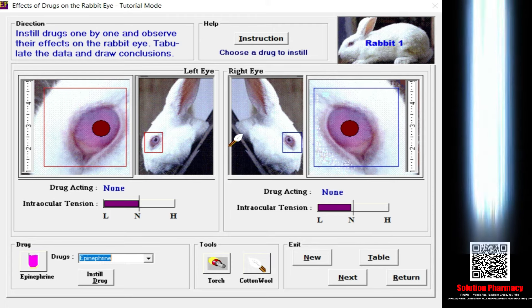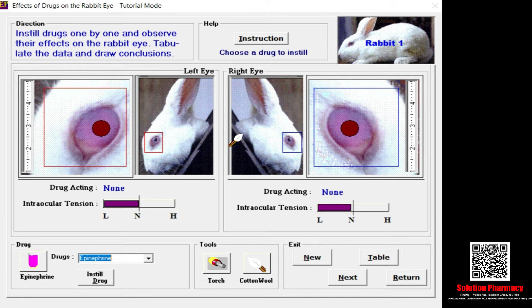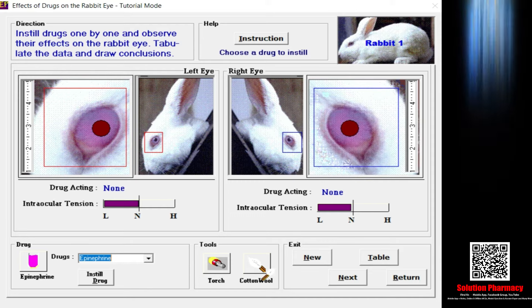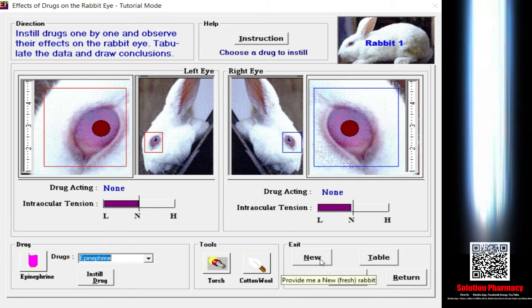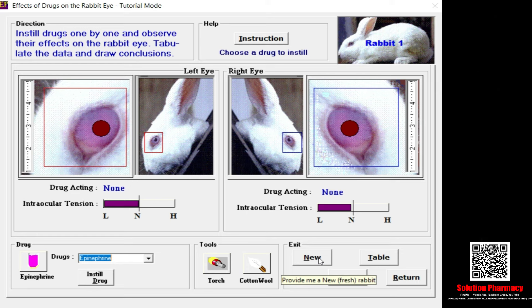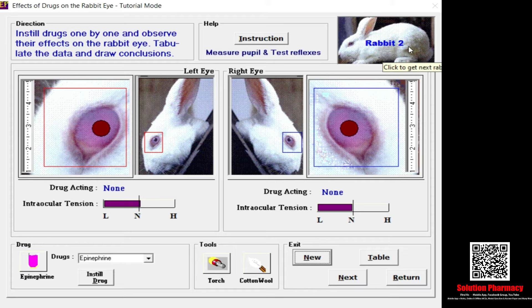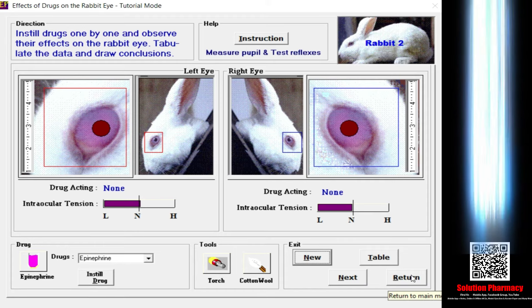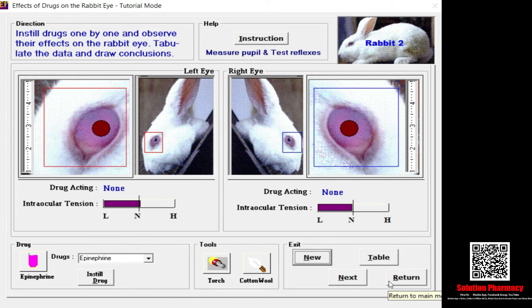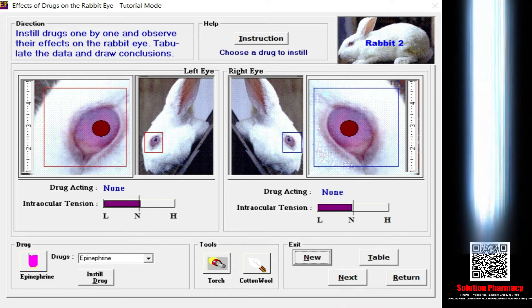These two tools — torch and cotton wool — are used to study reflex action, and they will be especially helpful when testing local anesthetics. Regarding navigation: clicking the new button changes the rabbit number. Currently it is rabbit one; once I click new it changes to rabbit two. There is also a return button to go back, and a next button to go to the question and answer section.